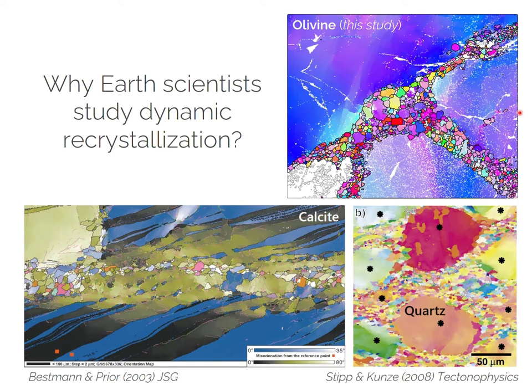The motivations for studying dynamic recrystallization processes in rocks are basically three. First, all major rock-forming minerals easily undergo dynamic recrystallization during plastic deformation, and indeed, all rocks in highly strained plastic shear zones in the lithosphere show recrystallization, making it a very common and important phenomenon to understand rock deformation.